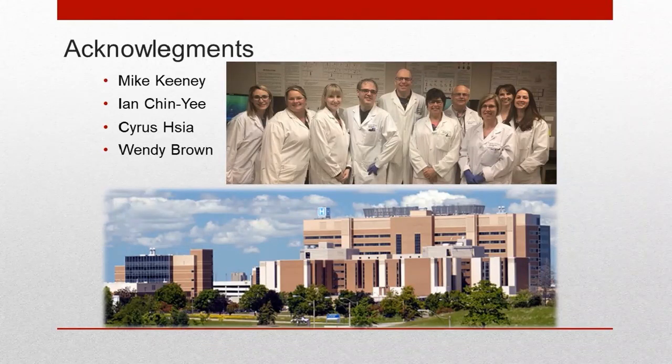When you have an acute leukemia case, when do you decide to add an intracellular tube? We typically do it once, if it's a diagnostic. If we know it's acute leukemia, then we have to lineage type it. We don't assume anything. I've seen enough weird stuff in the last 2 months that confirms that.